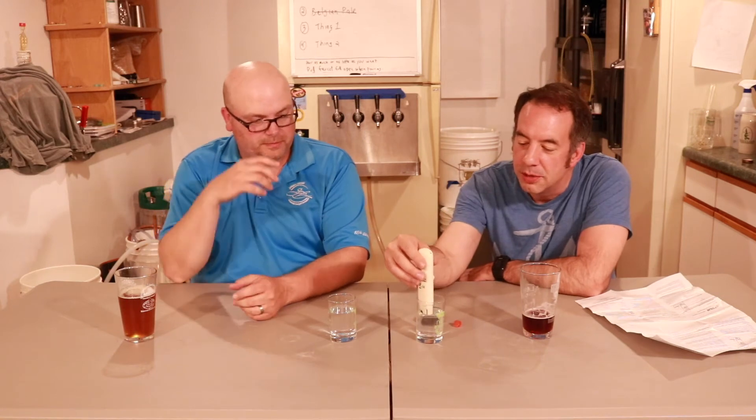So you have two samples here and we're actually going to try this out. This is the X-Tex pH pen — product code pH 50. It's as simple as turning on the power button. There's a little display that gives you a whole number and then a decimal. This is just distilled water. We should put the pen into this water — and what should the reading be? Textbook water should be seven. But your tap water might be a little bit less than that, depending on your residual alkalinity. Pure distilled water should be at seven.